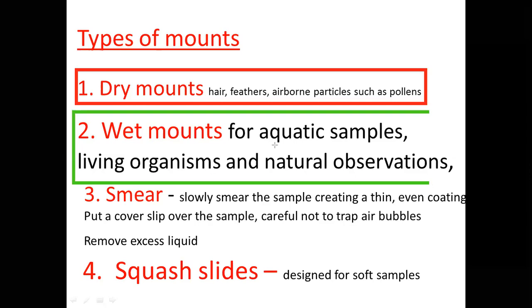The reason why this one is unique, we have just come from sectioning, where I've said we use a blade, we use a scalpel. Here we were not cutting anything, yet we made a slide. We used a dropper or a pipette, for that matter, and that's why wet mounts are very interesting. You just pipette, or you drop. You use a dropper and you drop whatever you want to observe on a slide.